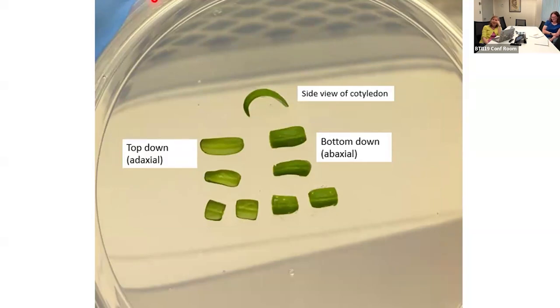So I appreciate the Rapidase. But that was for planting in soil, I'm assuming, right? Because that probably is a disaster for tissue culture, is it? It would be a disaster, yeah. But yeah, that was definitely for soil.